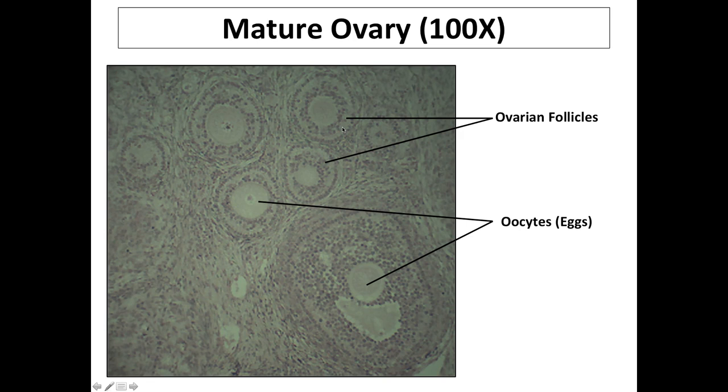In the ovary, that something in the middle is an oocyte, right? This is it. It's giant. So this is one cell right here with all of its cytoplasm and its nucleus, right? Here's another one right there, giant cell compared to what else you see, oocytes. These are developing ova. These are what will eventually be ovulated and then are available for fertilization.